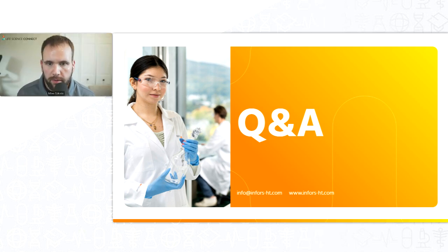Let's see, up next. So Mike, I think this one's for you. I think they're talking about the Multitron here. They were asking, does it connect to external monitoring devices or allow for remote monitoring and control? And if so, what are the options? Yeah, that's a good question.